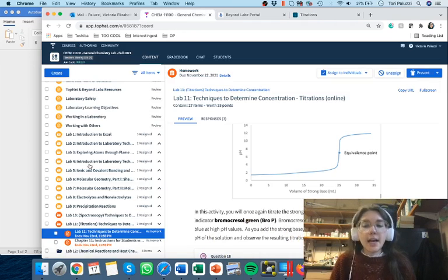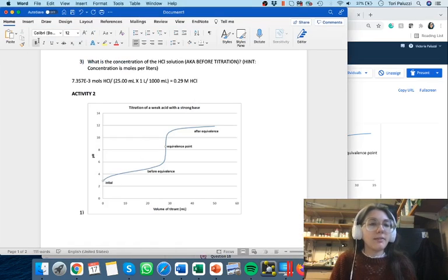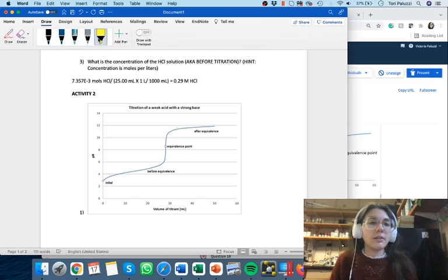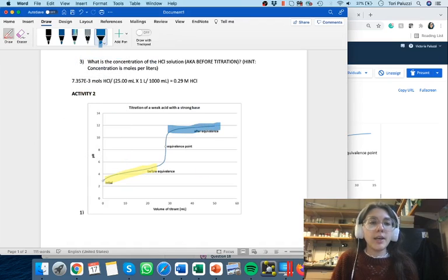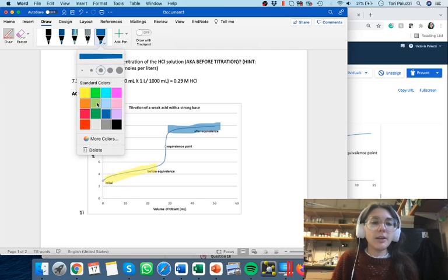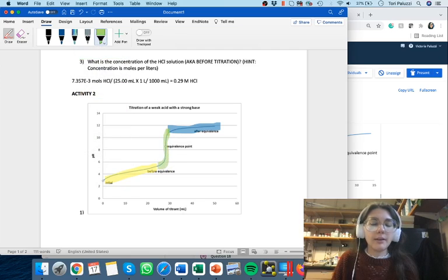It's going to be yellow at low pH levels. So if I give myself a highlighter, it's going to be yellow in the low ones, and then it's going to turn blue up here. Why it's called green is because in the middle, yellow and blue make green.